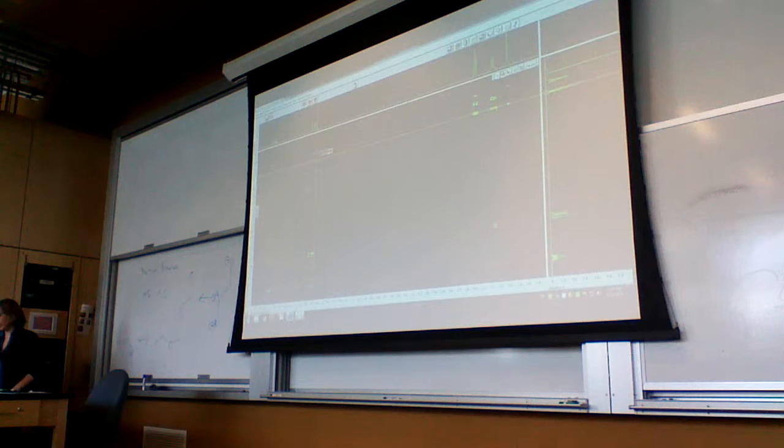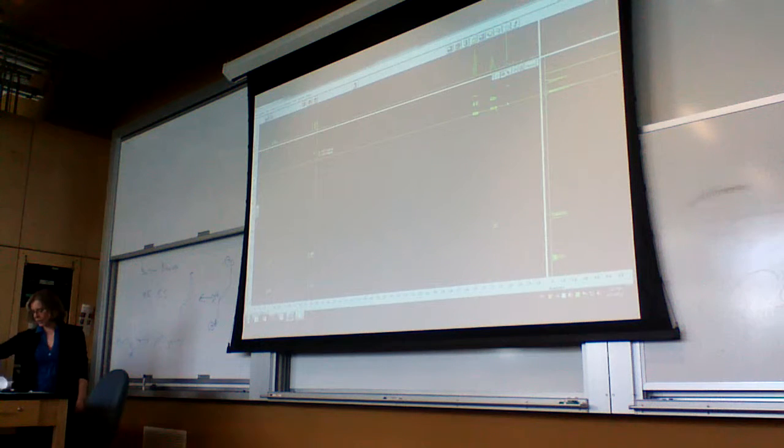Let's look at the HMBC. Probably what I had posted for today, we'll do that example on Friday. It's just more of, or HMQC.